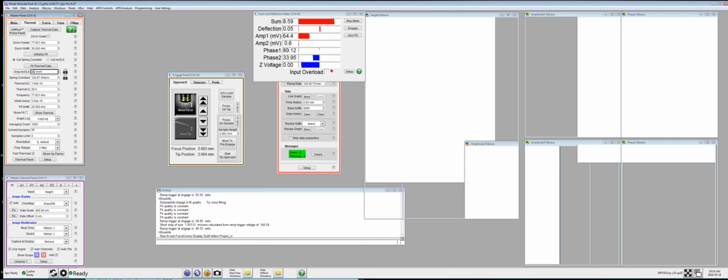This one is the amplitude in volts for the first mode, and it's very important to have that, because the Asylum will take this one as the real calibration. We'll have to modify this when we do the signal processing. We'll have to remember that data coming from the second mode needs to be divided by 3.47. So that's the end of the calibration of the second mode.